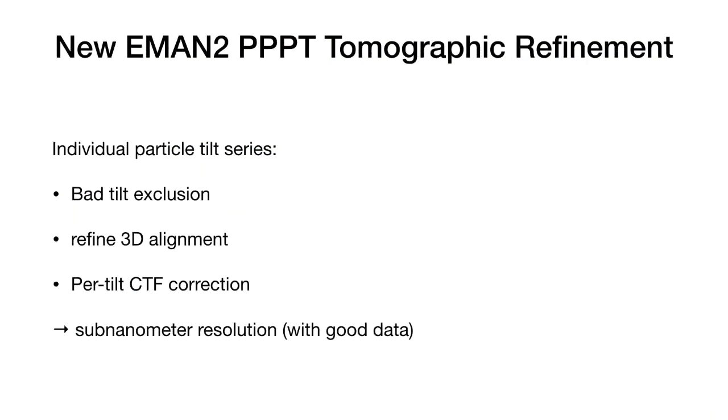Once you have done your coarse subtomogram averaging, which just involves averaging the 3D particles, the next thing we need to do is this high-resolution subtomogram averaging, this per particle per tilt based approach. So, the three key aspects of this per particle per tilt approach. As I said, we go back to the original tilt series, and we wind up with a tilt series for each particle.